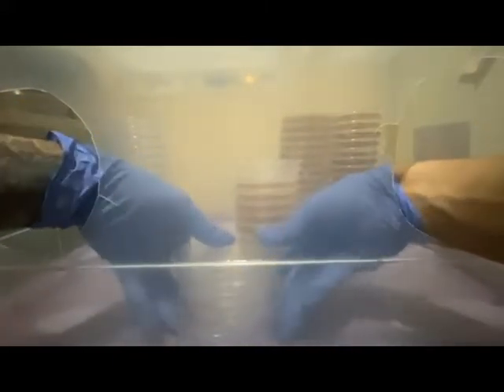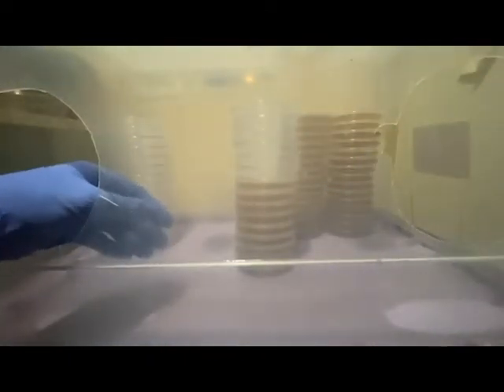You know what? These didn't open. These might be still good. Normally, I would pitch these out, but you know what? We'll do a week-long little test. What do you call it? A static control test.